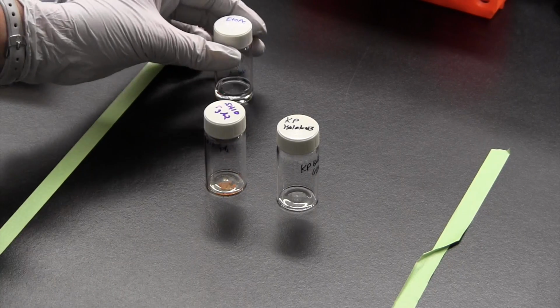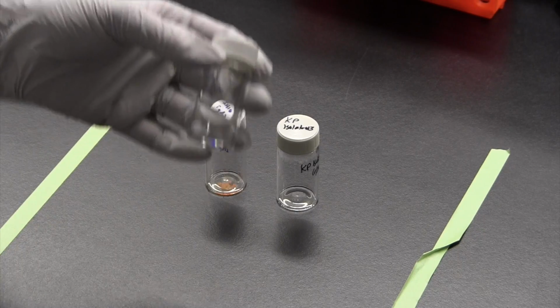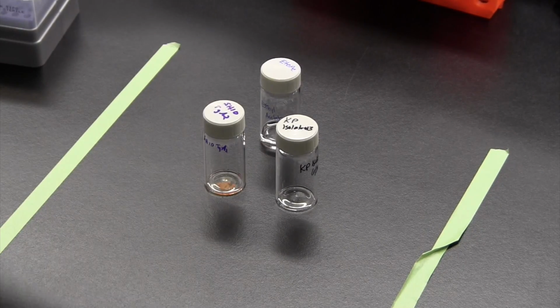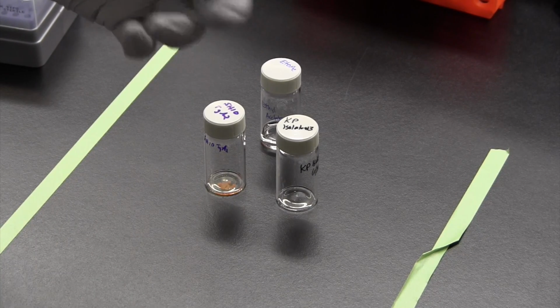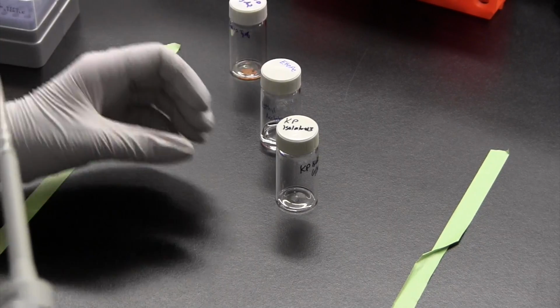At this point, it's probably easiest to aliquot your ethyl acetate into small bottles that your students can actually work with at their bench. You just want to be sure that you're impressing that they're not doing any deep inhalations of the ethyl acetate, and that they're using pretty good safety precautions in doing this.